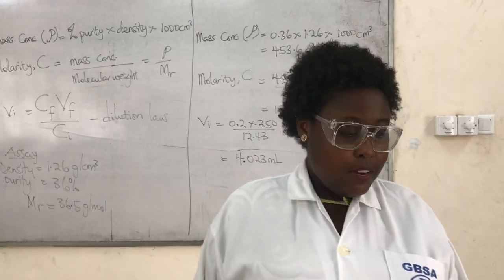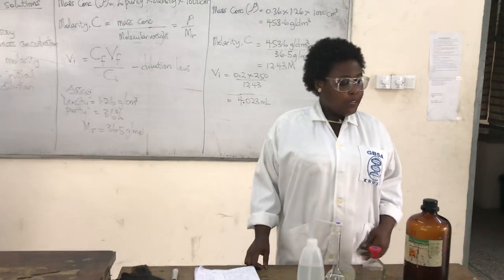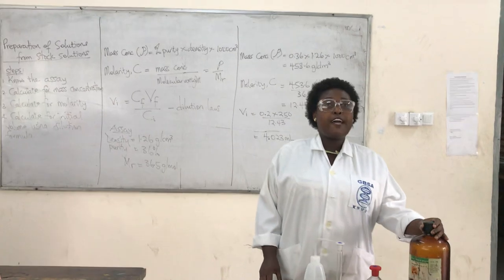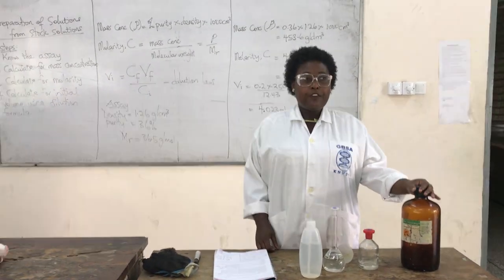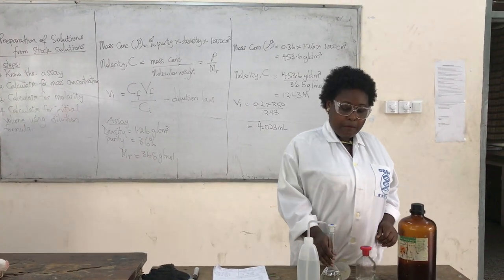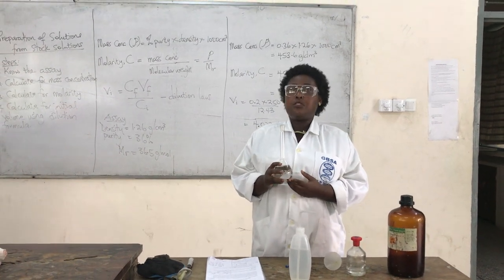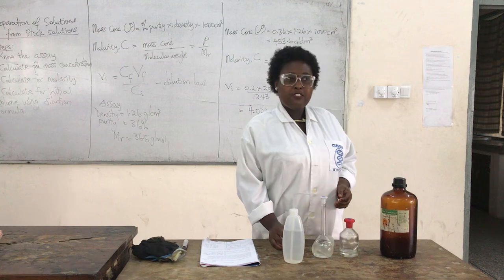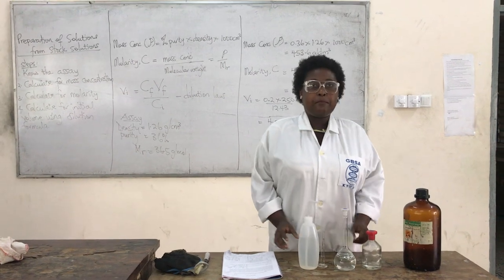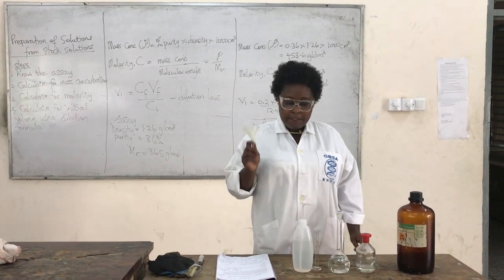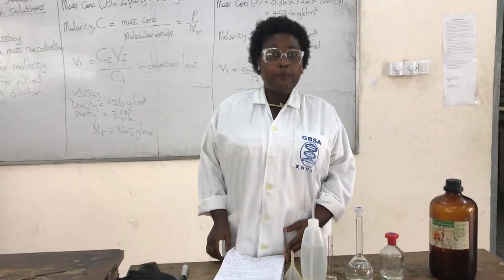Let me take you through the materials you're going to need for today's practical. I have here a stock solution of hydrochloric acid (HCl), a volumetric flask filled with water, a measuring cylinder, a wash bottle containing distilled water, and a funnel.